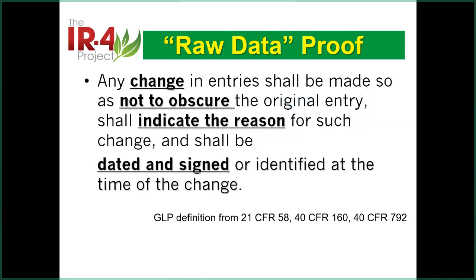If there is any reason, you need to write the reason. Then, because it's raw data, you need to sign it and date that. So you need to put your correct answer here. For example, if you make a change, you correct that, then you put the correct answer right before or after that.